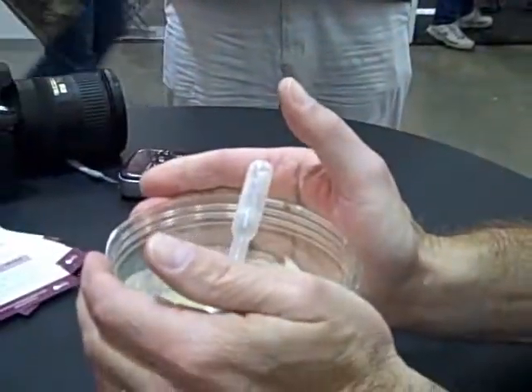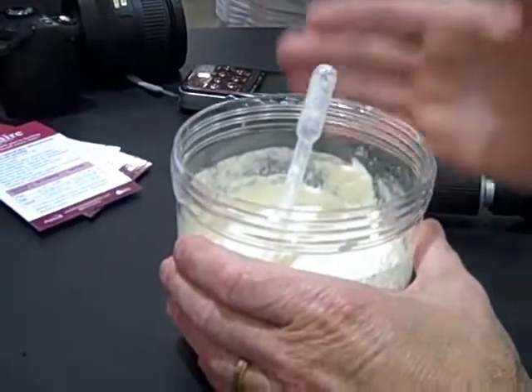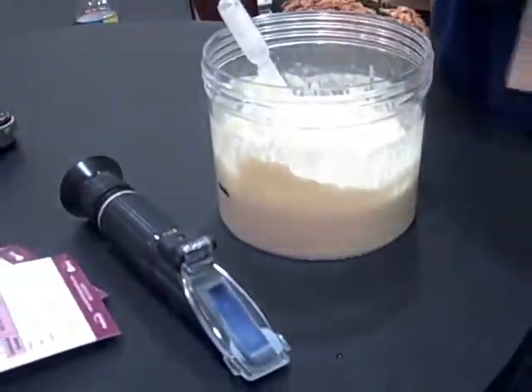If you gave a gallon of this product to a calf, it wouldn't receive enough antibodies or IgG to protect it against the diseases it's going to face. This is a tool that allows a dairy producer to separate good colostrum from bad colostrum, and then decide what to do with the poor quality colostrum. Using a colostrum replacer or supplement becomes a very viable alternative — he can use the good quality colostrum from his farm and replace the poor quality colostrum that would otherwise put his calves at risk.